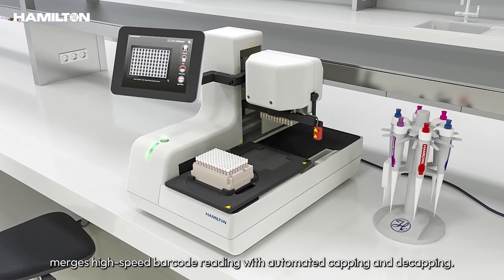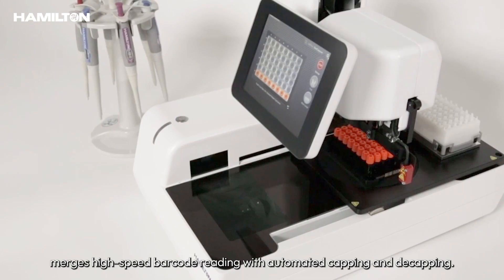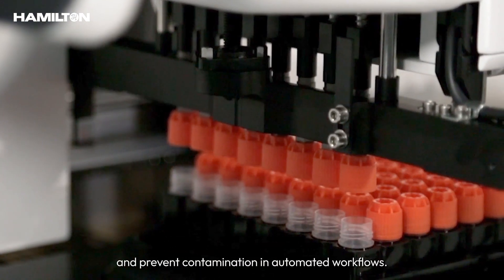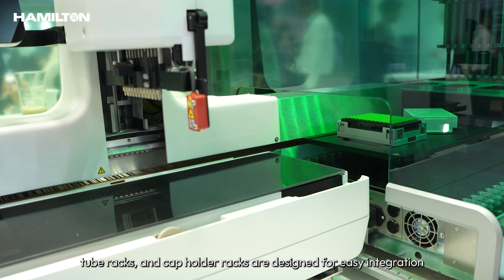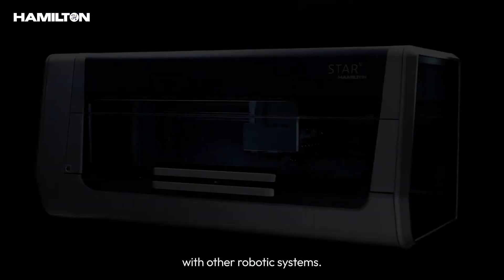The Lappi Lite integrated ID capper merges high-speed barcode reading with automated capping and decapping. The automated tube capper is engineered to enhance sample tracking and prevent contamination in automated workflows. Its extended linear rails, tube racks, and cap holder racks are designed for easy integration with other robotic systems.